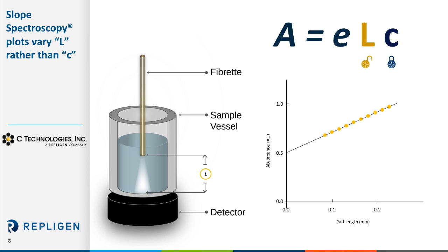The Solo VPE only cares about the change of absorbance from path length to path length to generate an accurate slope regression. The same would apply for things like baseline correction as well, where typically most buffers and blanks have no absorbance change over path length, therefore can be removed from the experiment altogether.